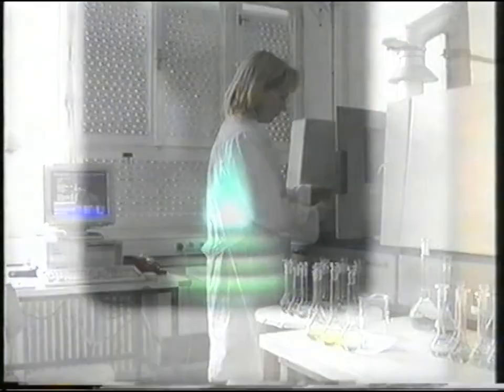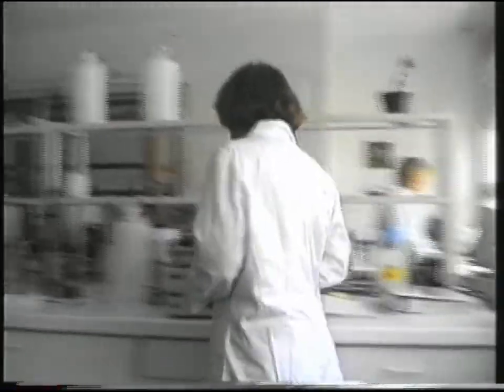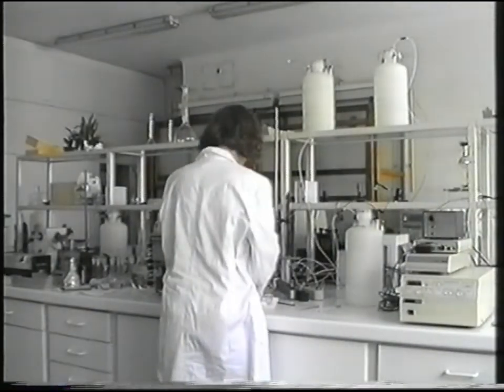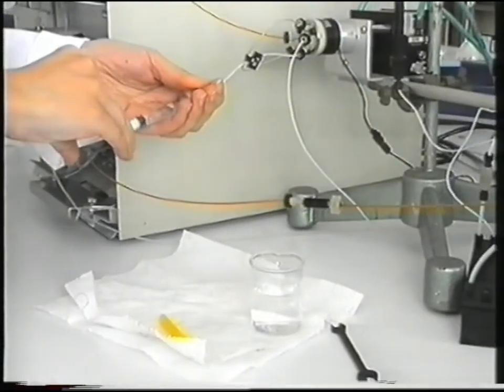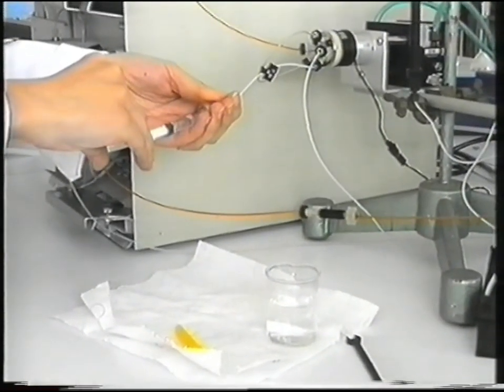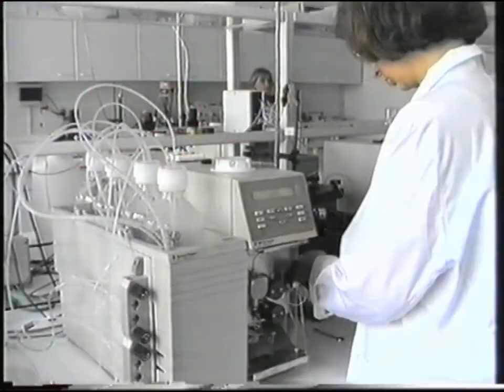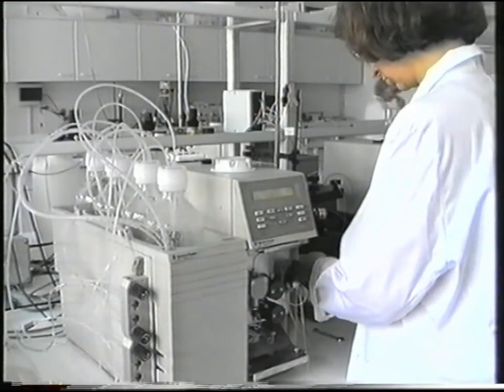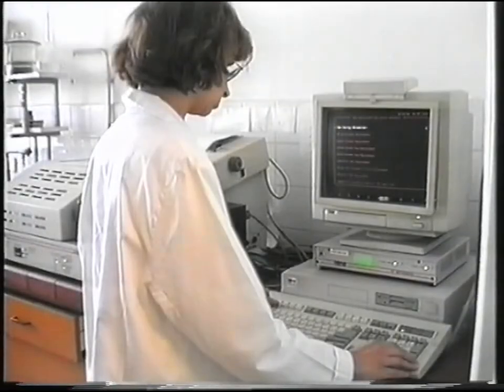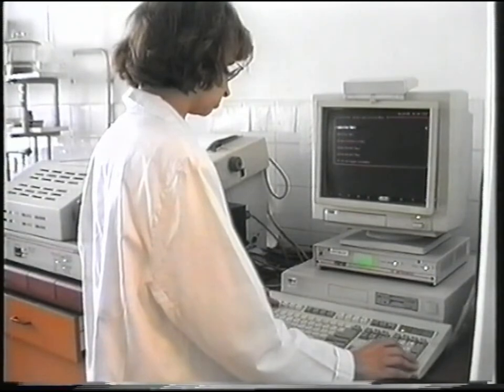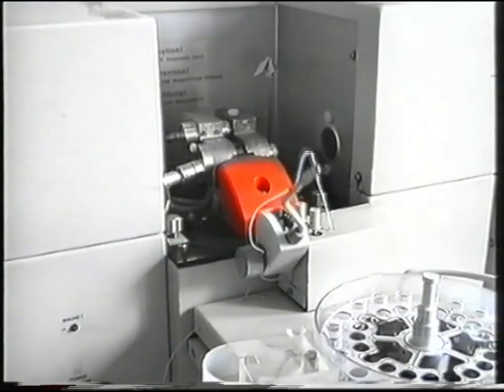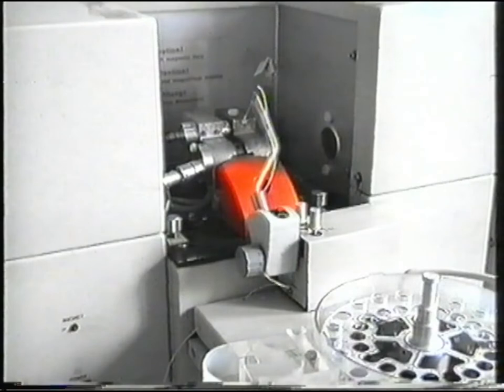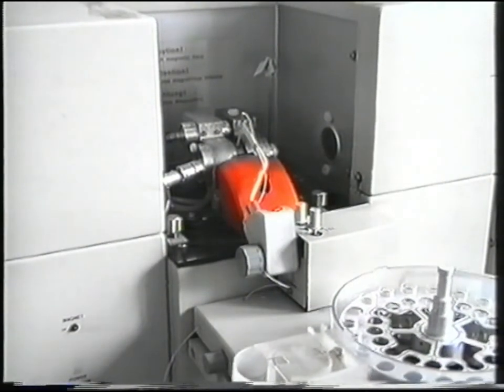Research at the laboratory for analytical chemistry is oriented towards the investigation, development and automation of analytical systems and the development of methods and procedures using various techniques such as ICP atomic emission spectrometry, voltammetry, ion chromatography, hyphenated techniques and so on. Investigations of electrochemical sensors and microelectrodes for various applications in environmental analysis and biological systems are also important.